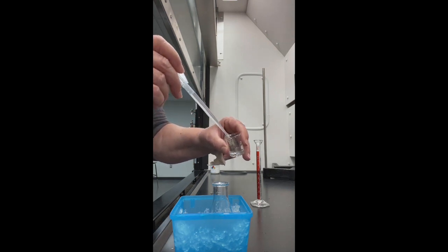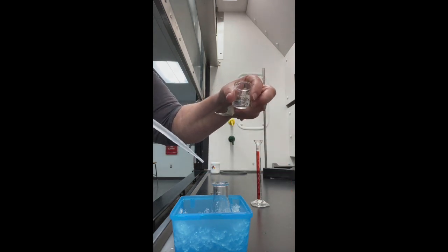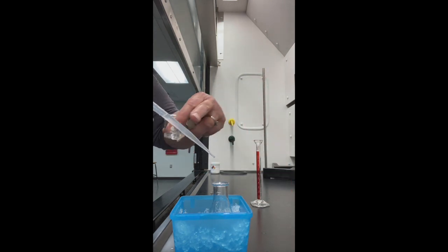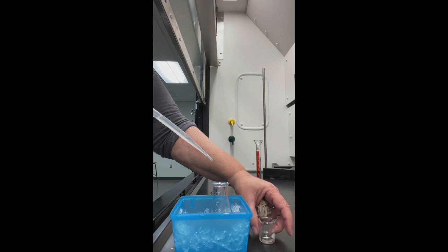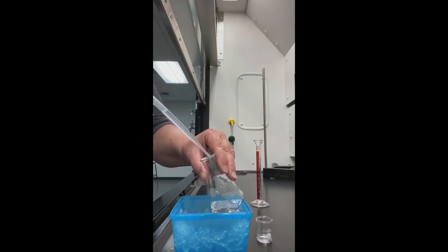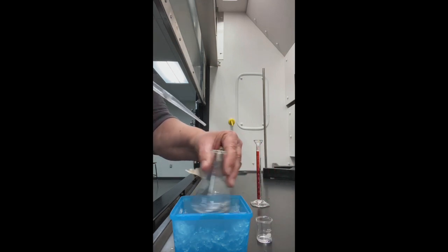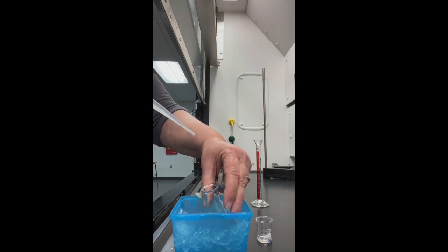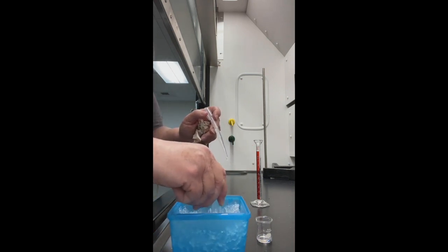I'm going to add this slowly dropwise. I had to put it in a small beaker because my transfer pipette did not fit in my 10-mil graduated cylinder. So I'm going to slowly add this dropwise with swirling.